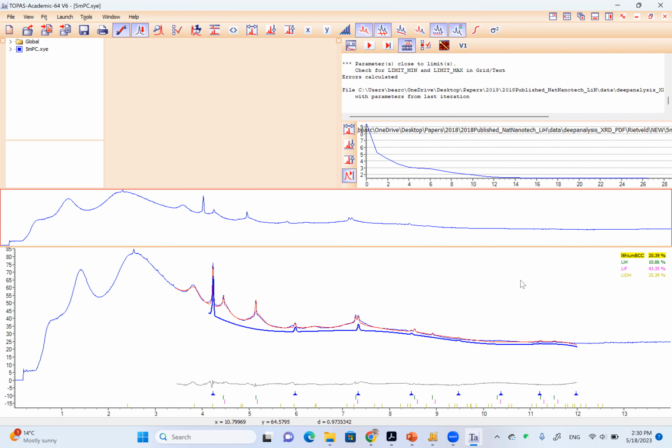So usually this metal is a very dominating phase in a sample. And that means we are already very certain we have this metal. And so the trick, from experience, is you do not want to refine this metal peak's lattice parameter in the beginning. You just put in a standard one, or the one from our previous refinement, right? So we have several works published on interface calculation.